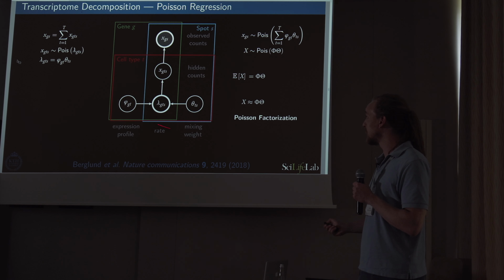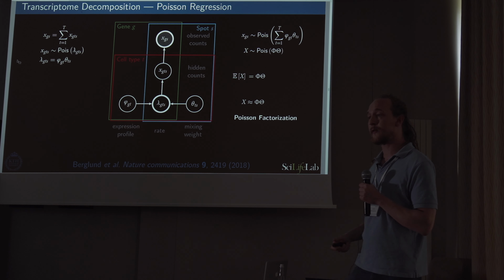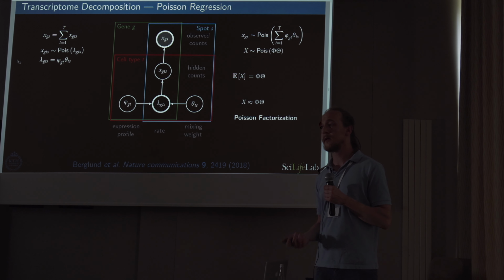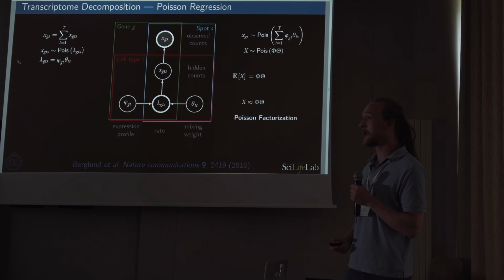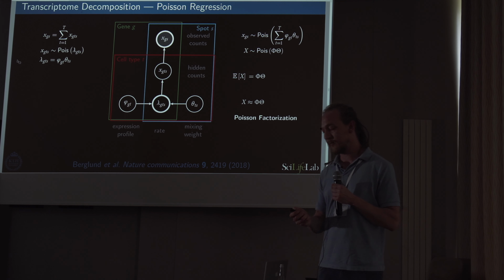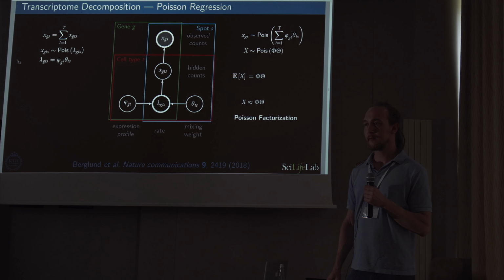We didn't specify on this slide any priors for these matrices, but that is obviously necessary. And in this publication, we had mostly gamma distributions as priors here. And the large T, are you giving this a priori? Yes, that is to be determined by the user of the application and will require experimentation.